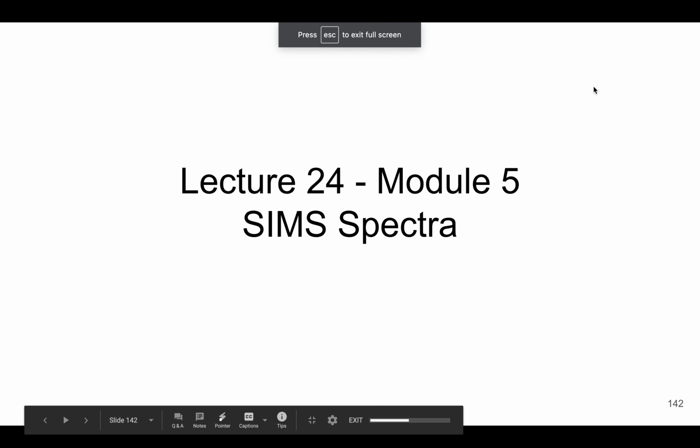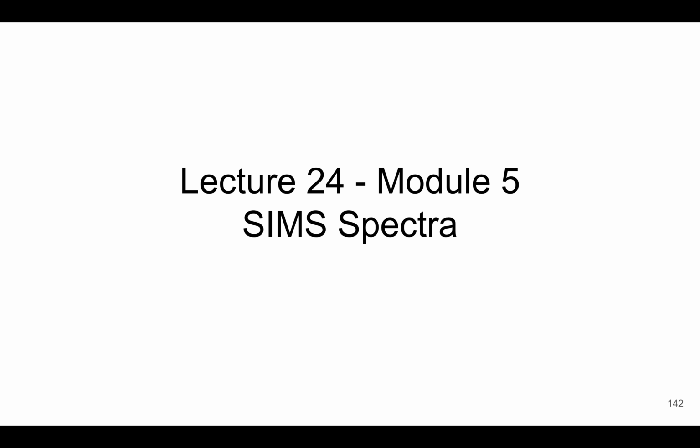All right, so now that we've talked about the basics of SIMS, and a lot of the instrumentation involved in SIMS, let's look at the actual spectra. So what we get as results.